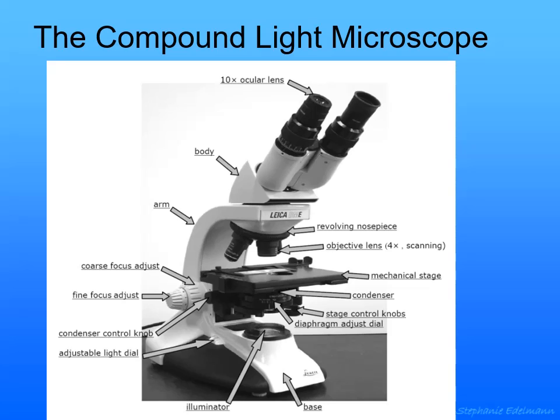This slide is just to remind you of the parts of the microscope. I go over those in the lecture part in detail, but when we're talking about the things that you need to twirl, this is just a little reminder to help you remember. Also, this or the other microscope may be the images you're going to see in the exam.